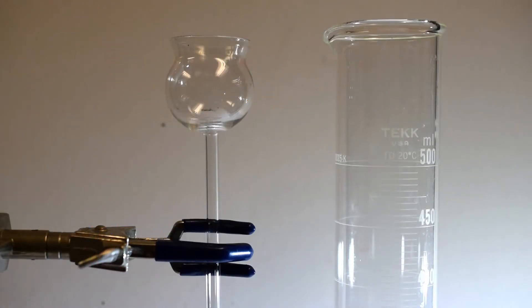To prepare the sugar density column demonstration, a 500 milliliter graduated cylinder and a thistle funnel are needed.